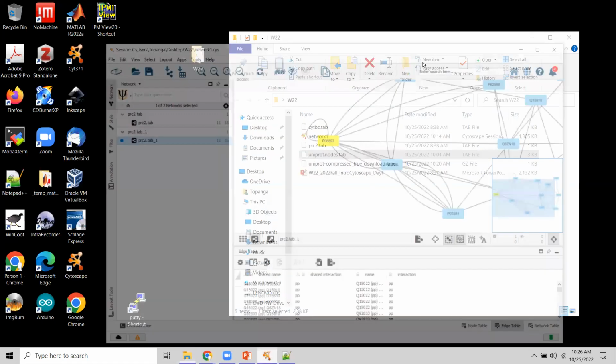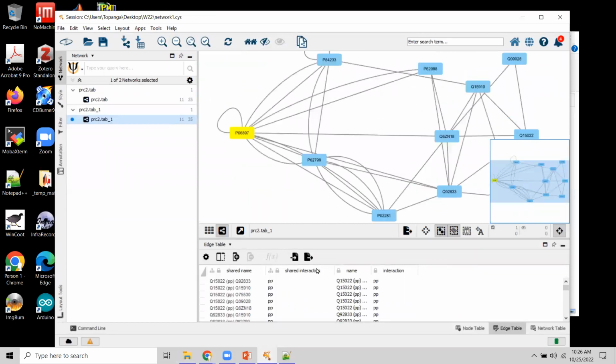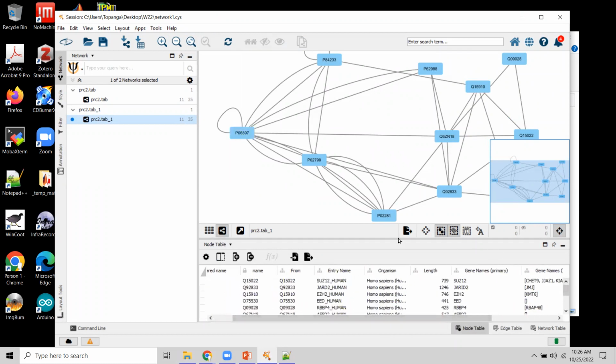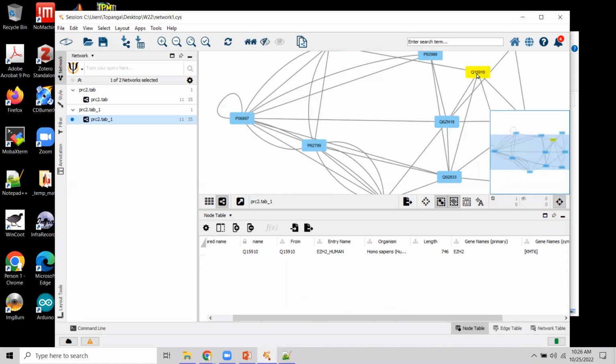Okay, so here's our network, this time with a bunch of things hanging off the protein nodes. As you've noticed, maybe, when I click on and select one of the nodes, I see only information of this particular node showing up in the table. If I've got more than one, then I'm seeing only things that are selected.